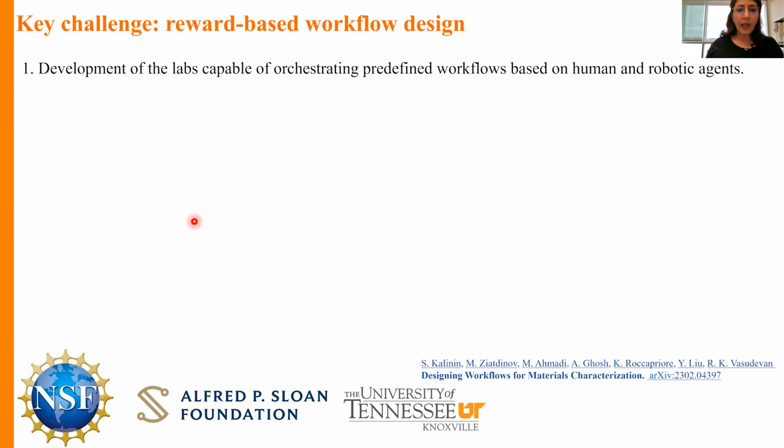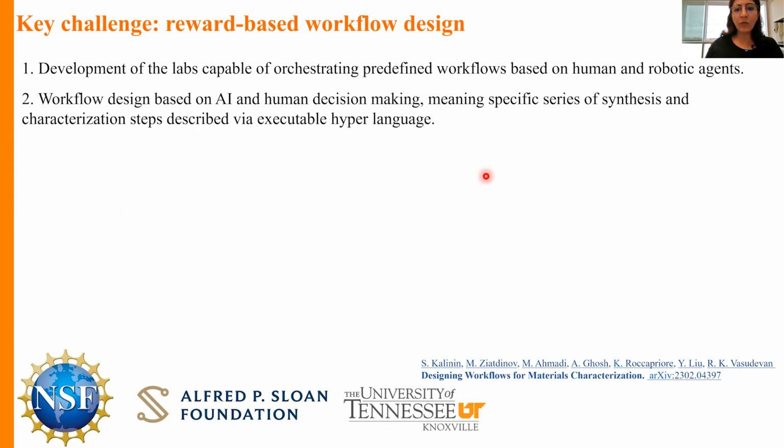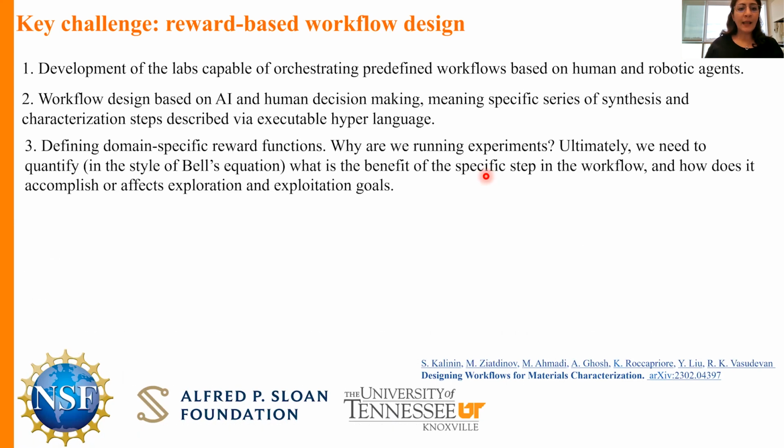Sure. My colleague and I have defined several challenges for labs of the future that we think are important. First of all, as I said, we need to define the workflow based on a combination of human and robots. We believe that the labs of the future cannot be only fully automated. It's a mixture of human and robotic agents that is necessary, in our opinion. Second will be designing the workflow, again, based on the decisions of the human and the robot. And then defining basically the reward and value function, why we are doing that for a specific functionality or application.